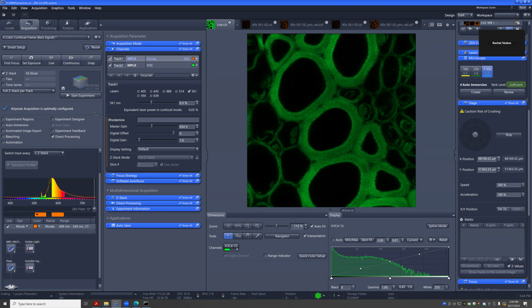Between users, how much time would you suggest before turning it off and on? It's not a big deal, but the biggest thing is the warm up of the system and then cooling down. So if there's someone within half an hour, I would leave it on.